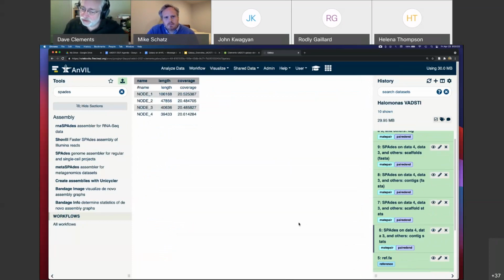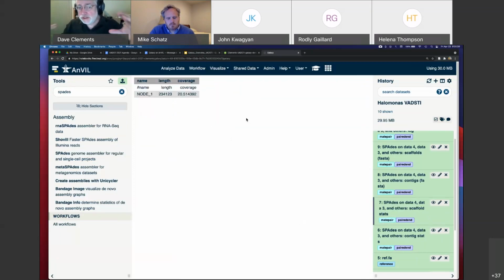It wasn't successful at building the whole chromosome, but it was successful at building 4 contigs. So 4 high confidence places. It was also successful at building a scaffold, which in this case I think is just 1. So it actually did come up with 1 chromosome, but it has some low confidence stuff that connects it, okay? So we're still pretty confident, but not entirely.